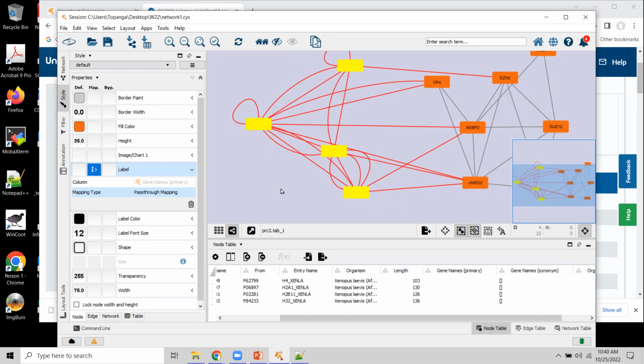So then one way is to ignore those if we don't care and we hope that there was another experiment made with the corresponding pairs of human proteins, or we can keep them, but then we might run into funny problems. Apparently, UniProt wasn't able to get identifiers for those things, the gene names.